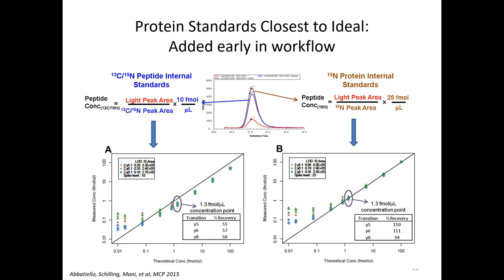So what we did is we plotted the light peak area, which was the same exact information in a single raw file. On one hand, we would normalize it to the fully tryptic synthetic peptide, the blue signal, the C13 and N15, and plot that in a response curve. This line here is the x equals y value.